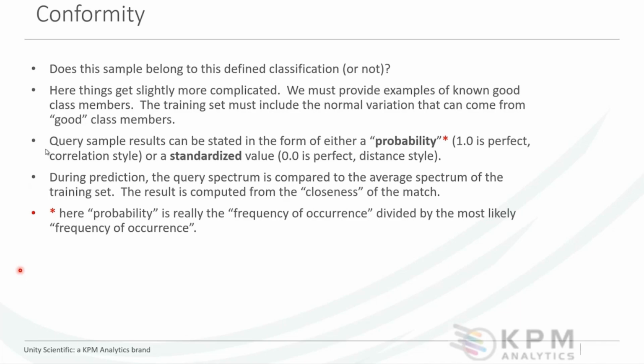One of the ways that I saw that this was being used in the past was for bakery mixes. In a bakery mix, there was not a lot of value to trying to predict individual quantitative constituents. So there was no moisture measurement, there was no ash or protein measurement that was useful or needed for bakery mixes.